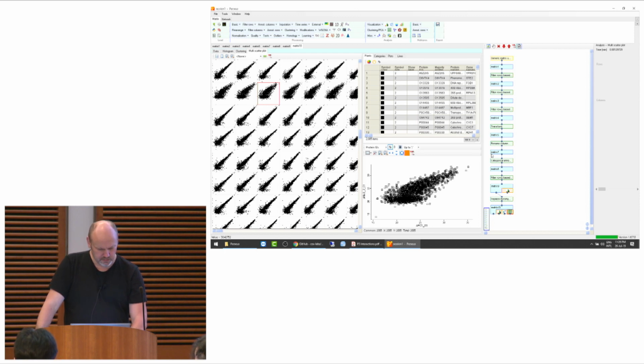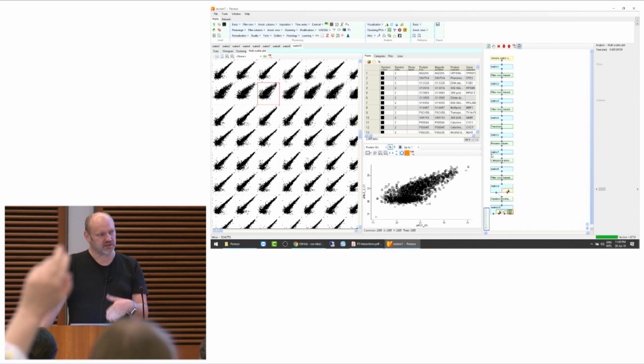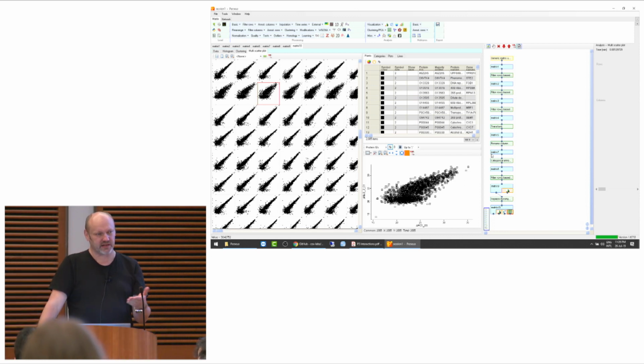Okay, so we're ready to go ahead. So you could now exclude the suspicious sample here, but I think we just take it along now. In the end, it anyway should not appear in results because it's a negative control. But if it would appear in results, then we know that this is the wrong result, basically, right? So, Juergen, yes? We would have another question.